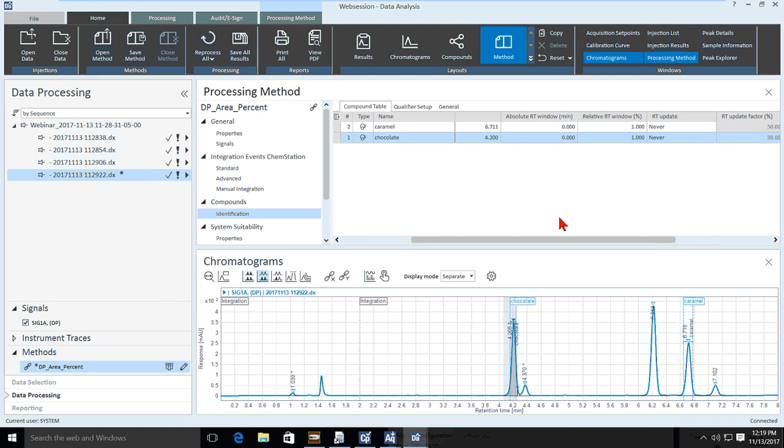Or I can also do, let's go to 0, I can also do it based on percent. So if I don't want it at 1%, I can do 10%, and it goes on to a percent left and right of the peak, right? So those are how you can change some of the windows.